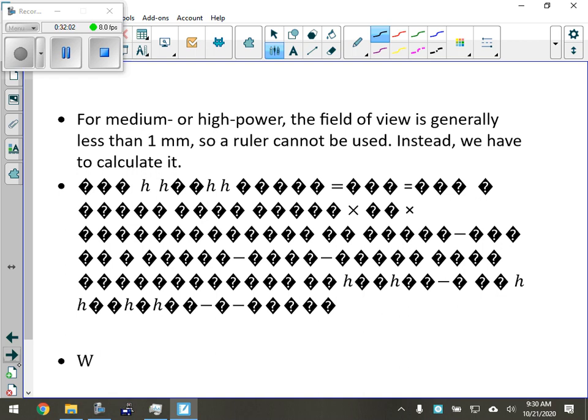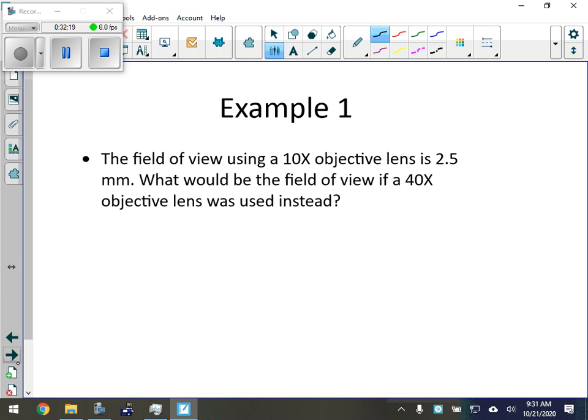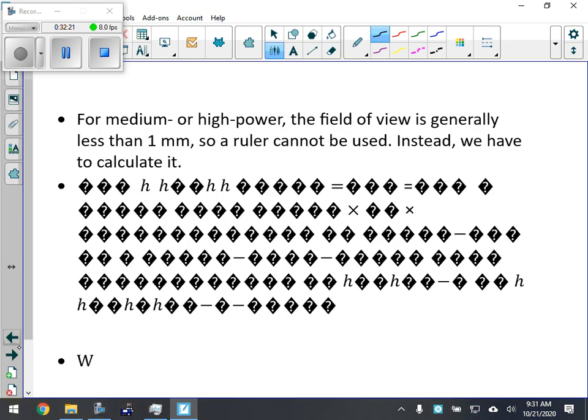But what does it say here next? Okay. For medium or high power, the field of view is generally less than a millimeter. So a ruler cannot be used. Instead, we have to calculate it. Okay. And that's the formula right there, apparently. And it looks a little something like this.